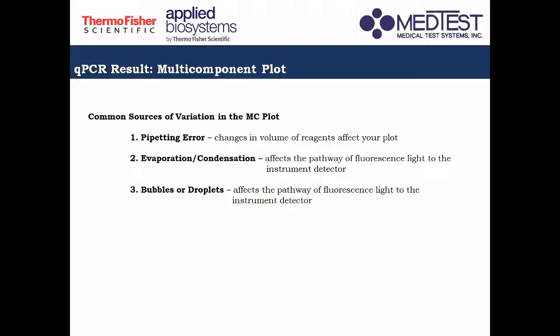And it uses a set of temperature changes na umaabot usually ng 95 or 94 degrees Celsius. So it's a bit high. And this will cause your liquid to evaporate. No? Now, once the liquid evaporates, it will somehow distort the way that the instrument will detect your sample. So para siyang nagfa-fog doon sa camera ng instrument nyo. So we would want to avoid that.